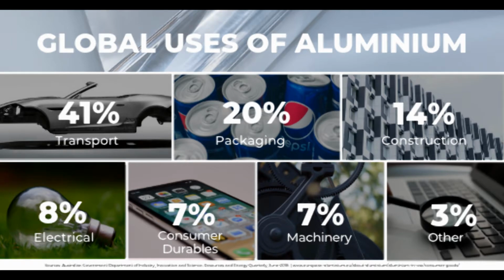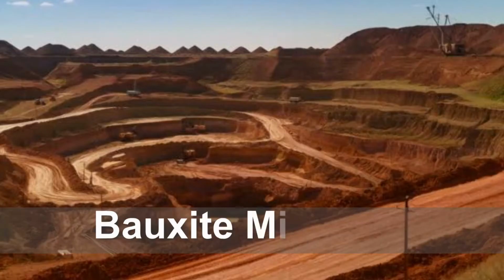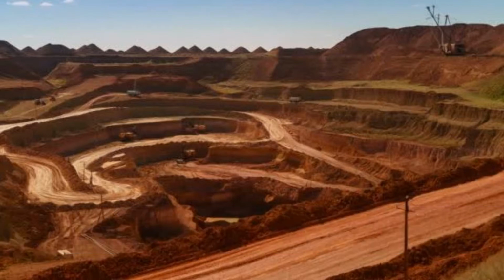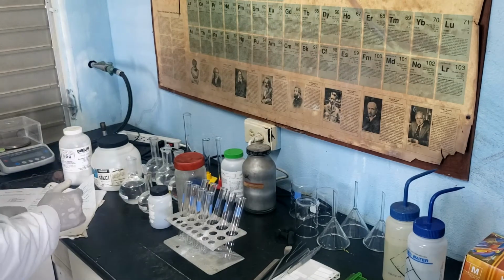Aluminum is one of the most abundant metals on Earth, making its usefulness more effective. The problem, though, is that aluminum does not occur naturally as a metal. It can commonly be found attached to silicon atoms in soils, rocks, and bauxite minerals. In this lab, we explore some important chemical properties of aluminum.